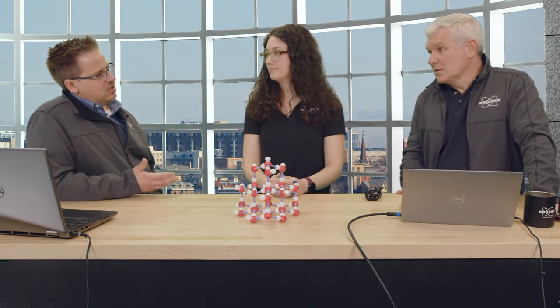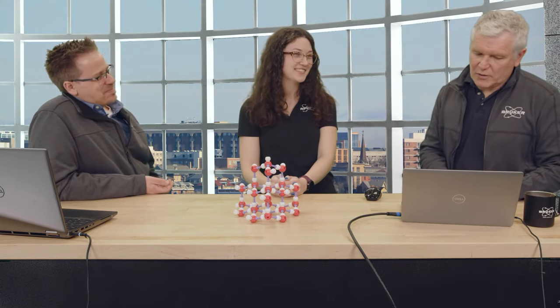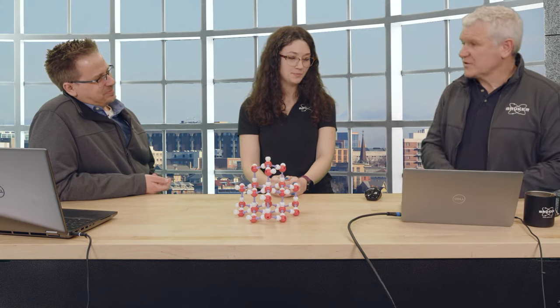So is there a benefit to using a duo system where you have access to both radiations? Yes, absolutely there is. It's always a good idea. This is what I said before. With these kinds of compounds, you spend quality time, and you might try a lot of things. I collect this at room temperature, low temperature, moly, copper, just to see. In this case, it didn't really make any difference at all. In other cases, it would matter.